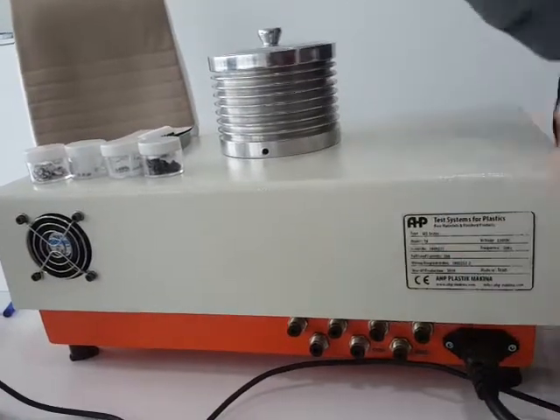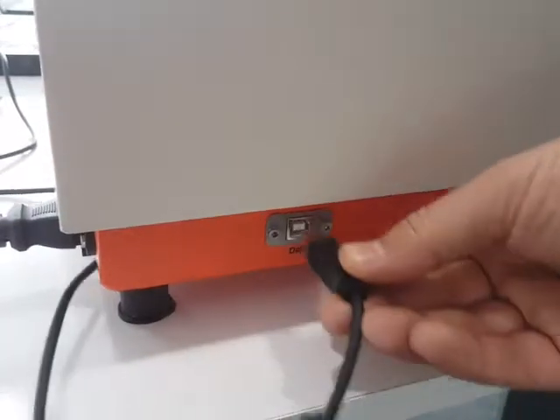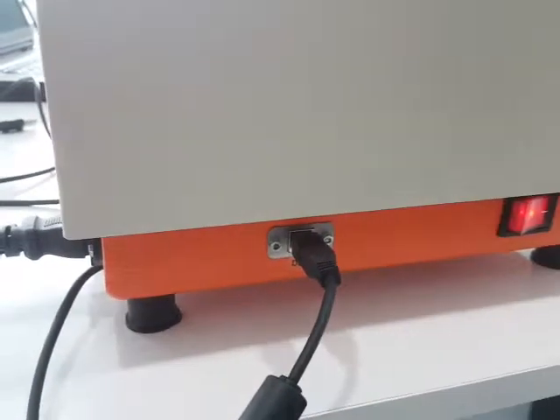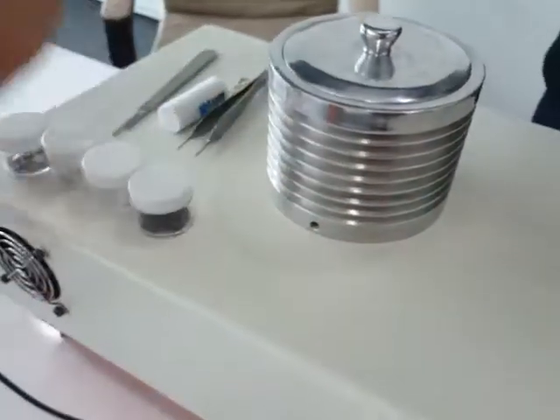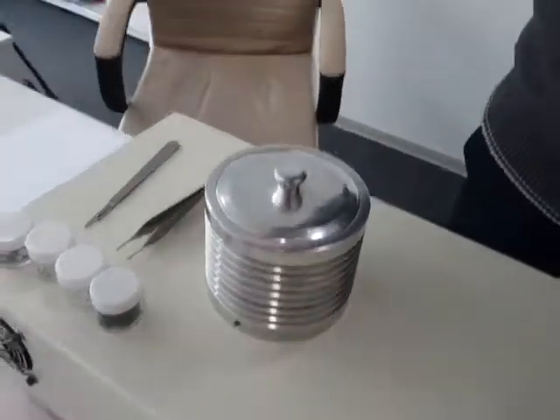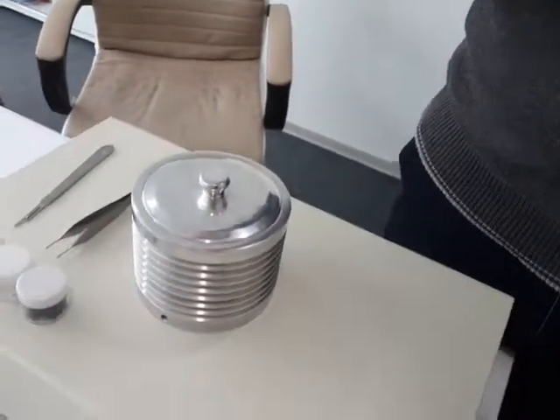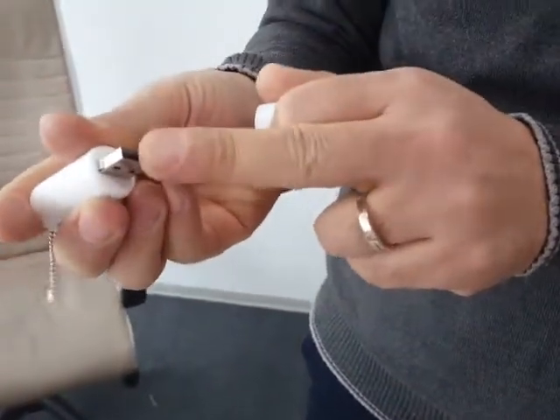The machine's power input is located here, the data input is a USB Type-B connection, and the on/off key is located here. The machine also has a USB dongle, which is a hardware key for the software.